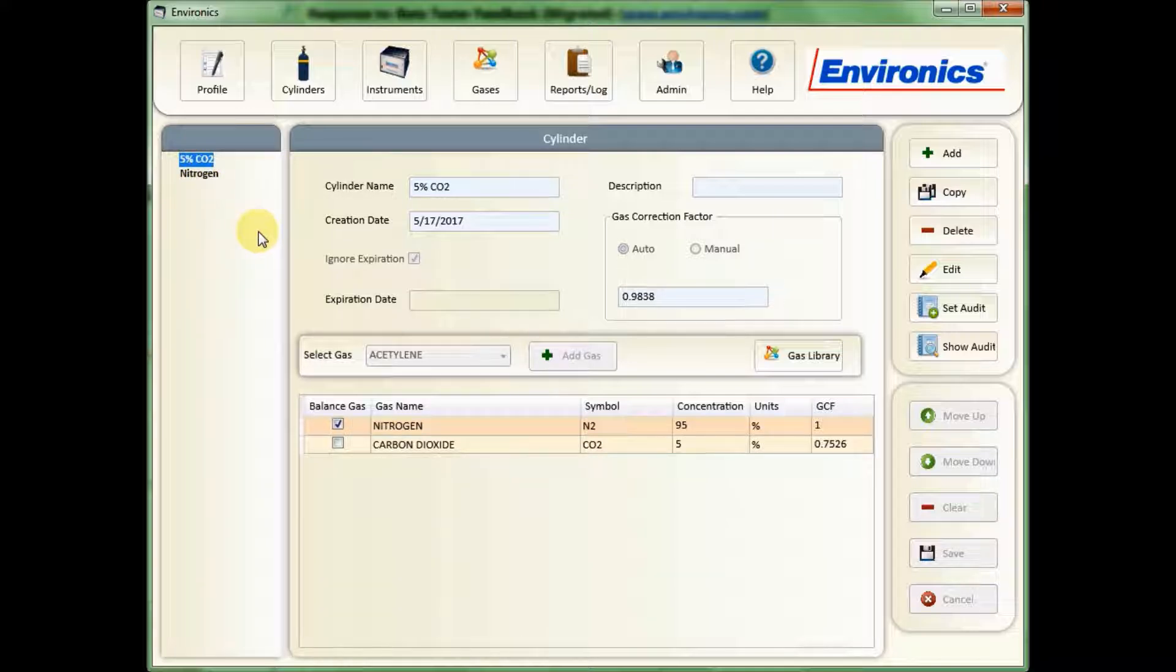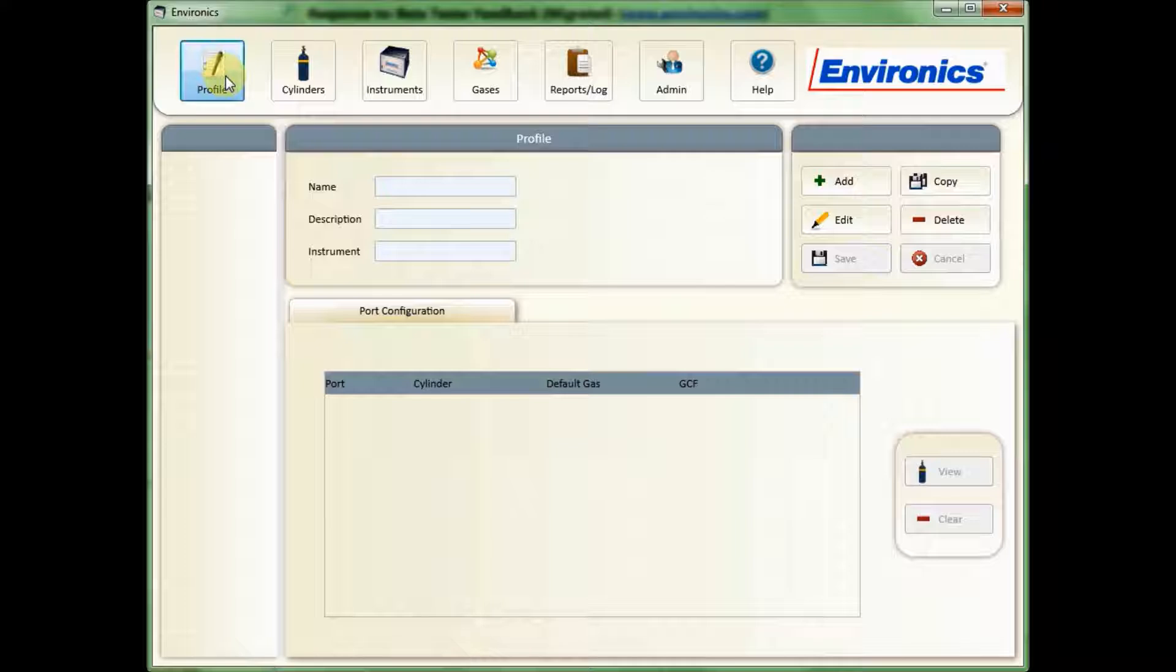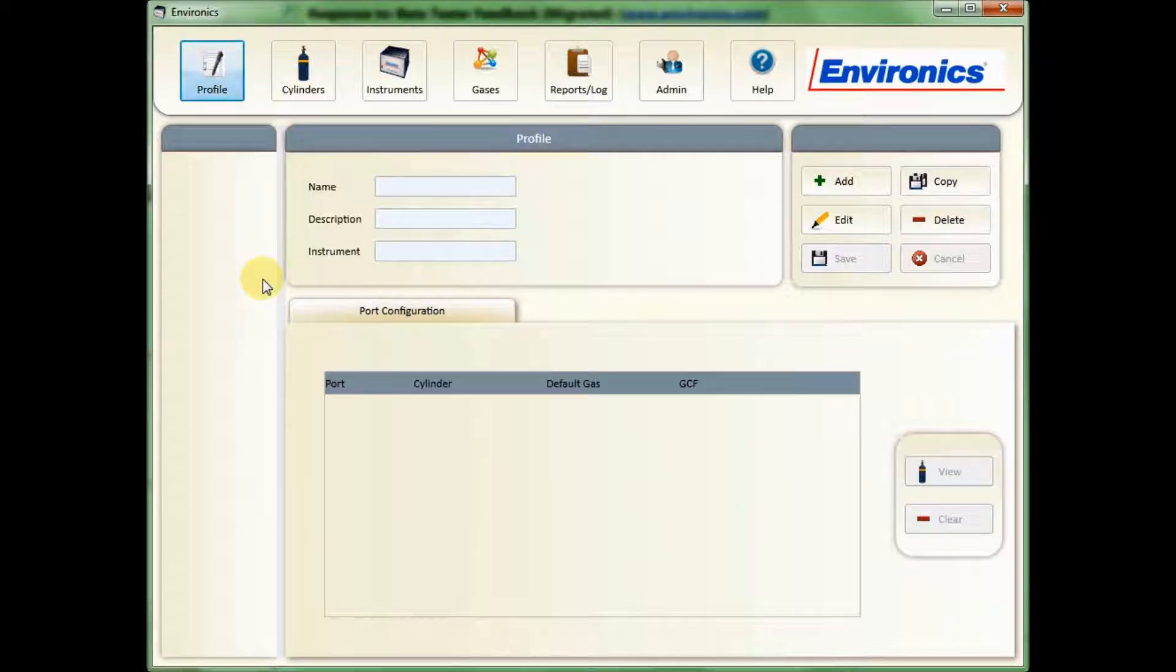So now we're ready to create a profile. The profile is the basis for all the programs you're going to run, the flow modes or concentration modes, or the program or schedule modes.